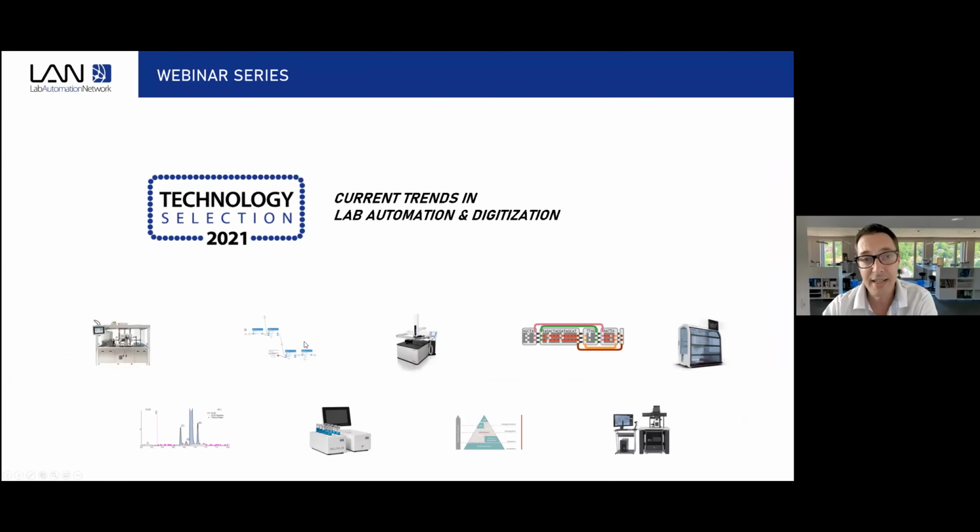Our webinar series as a whole will be focusing this year on special and outstanding technologies in the field of laboratory automation and digitization. We will be having interesting partners and companies presenting their technologies. There will be webinars on semantic technologies, a webinar on digital liquids, so digitization of liquid samples, and many more. And for today, we will be focused on parallel synthesis and reaction monitoring.